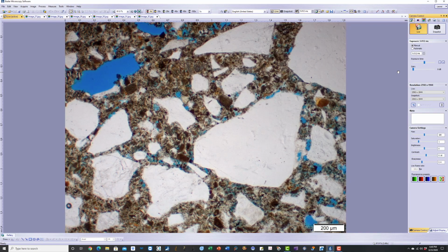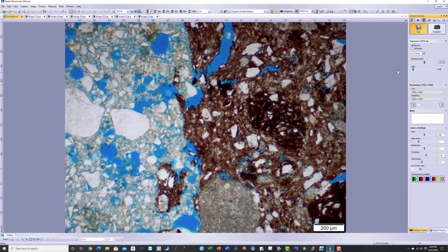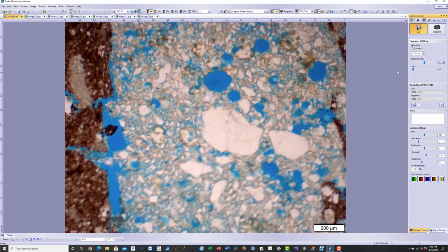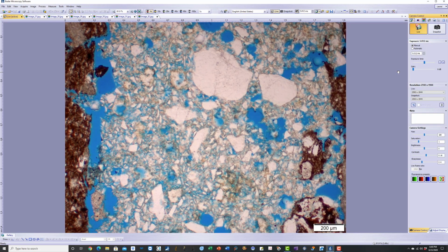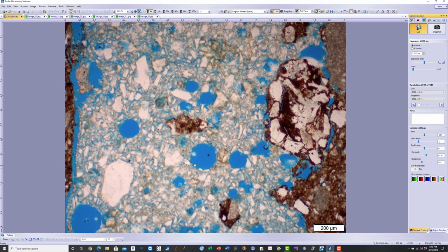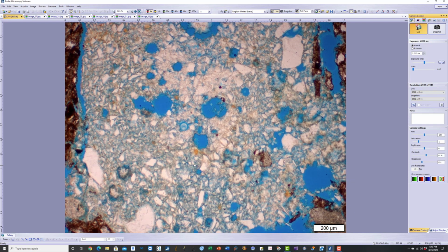And then comes the brick, and in between the bricks there is another type of mortar which is also common in many chimney environments. Here you have crushed silica. You see two populations of sand, a coarser population and a dominantly finer population. The finer population is finely crushed silica sand, and it also has silica flour mixed in as a cementitious material with polymer. There's a mixture of polymer and silica flour in a crushed silica based mortar. It's not a typical masonry mortar, but this kind of mortar is common in chimney environments.